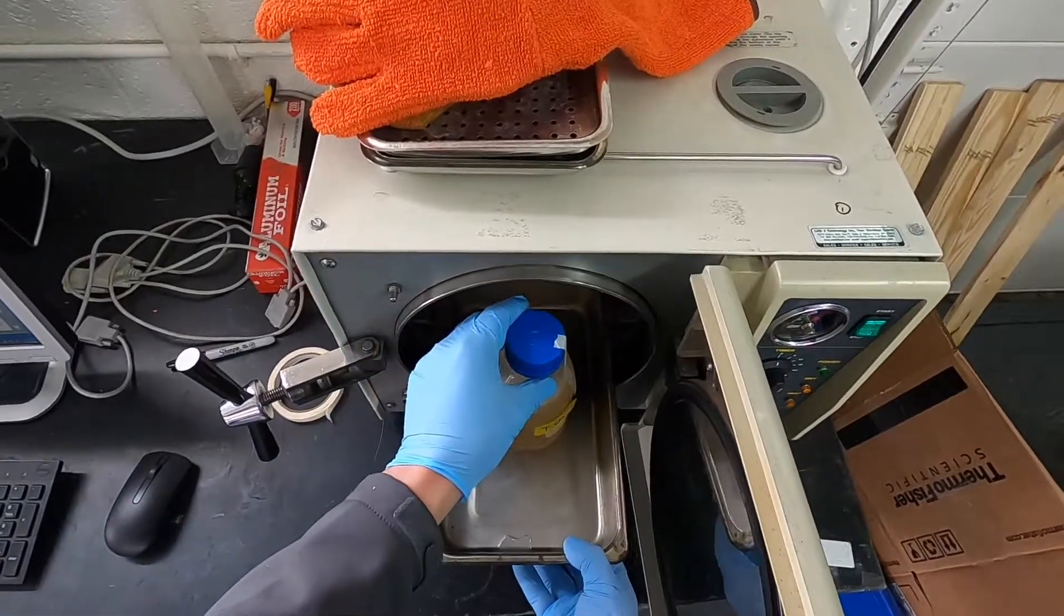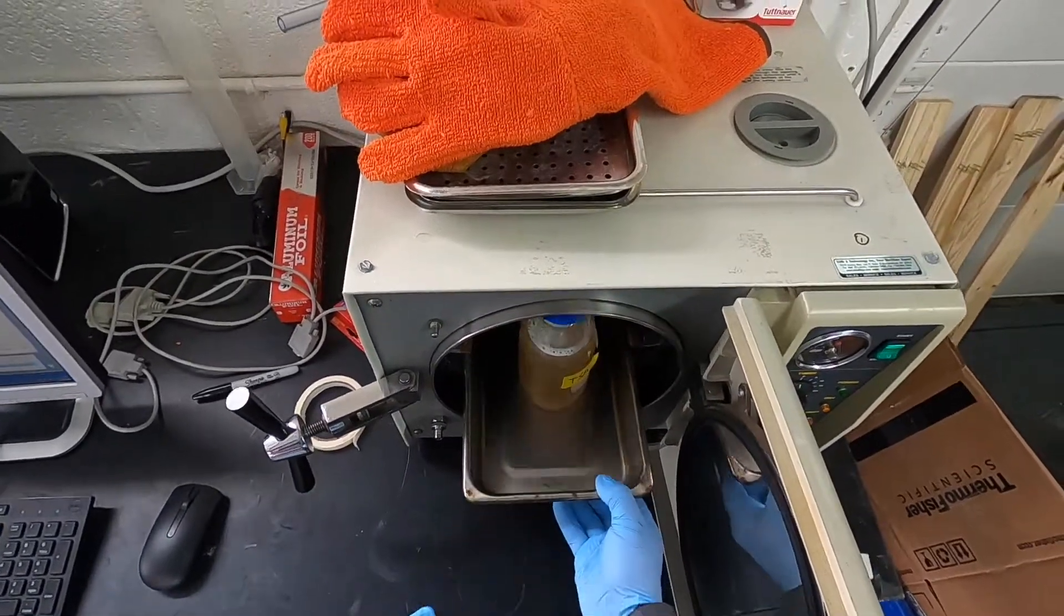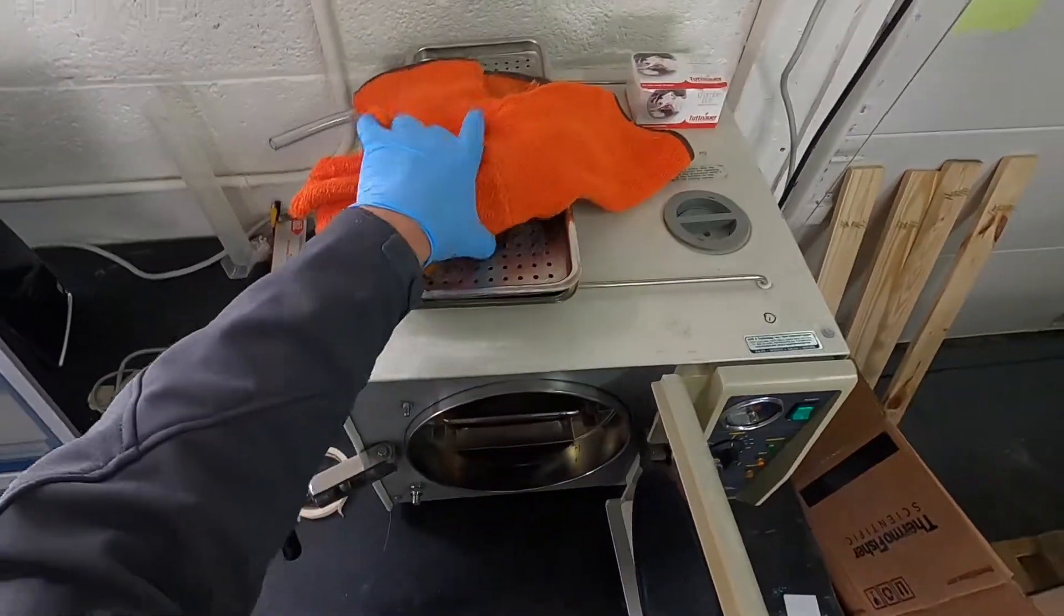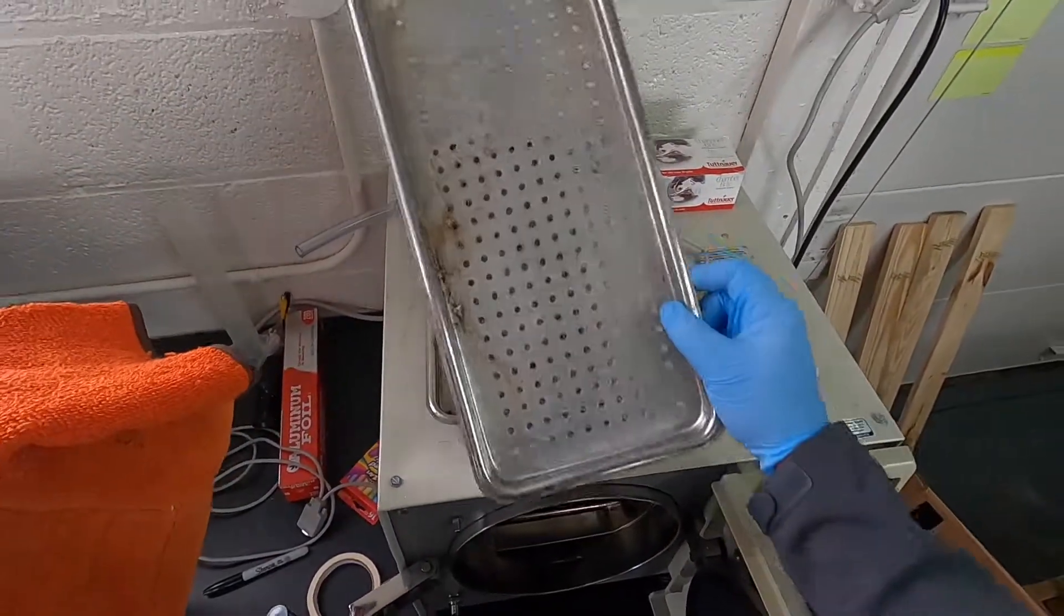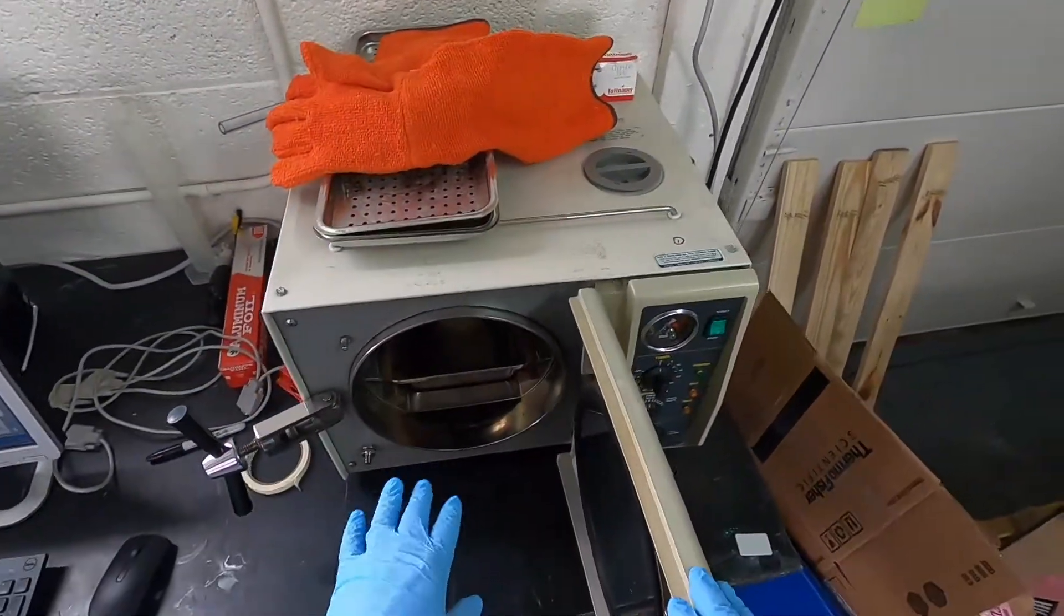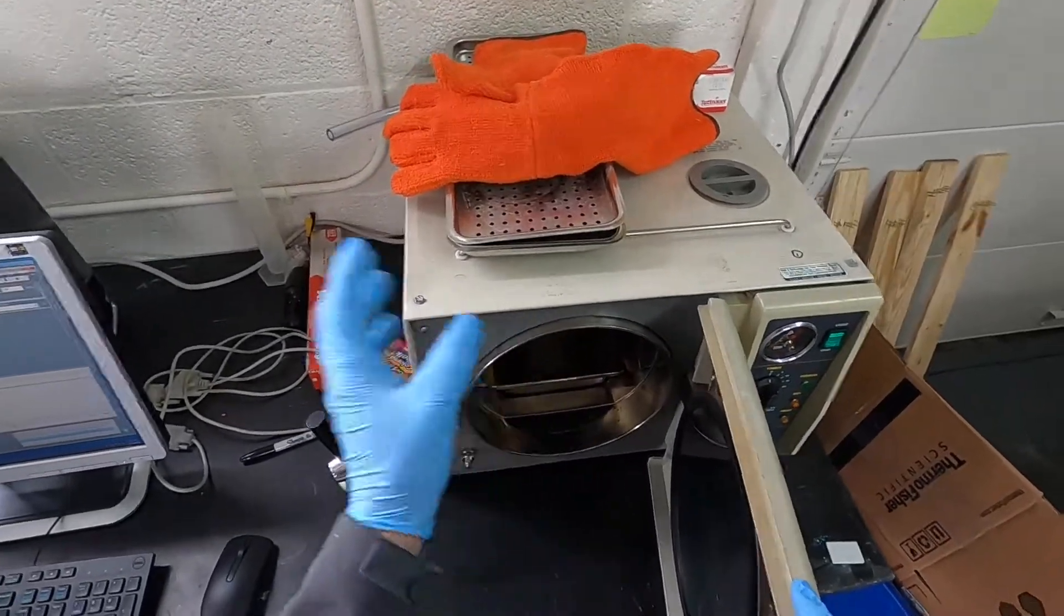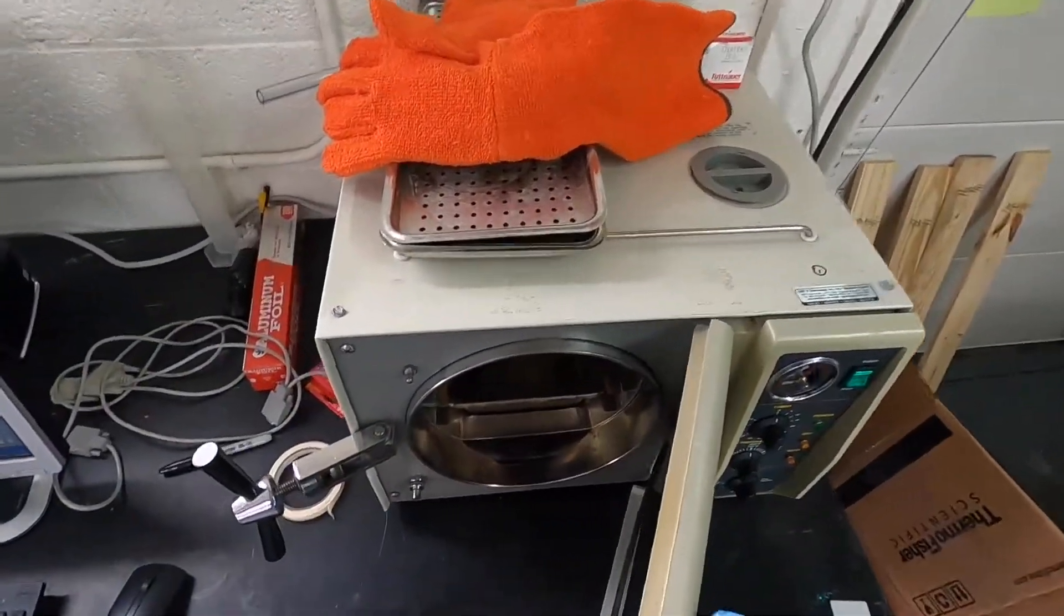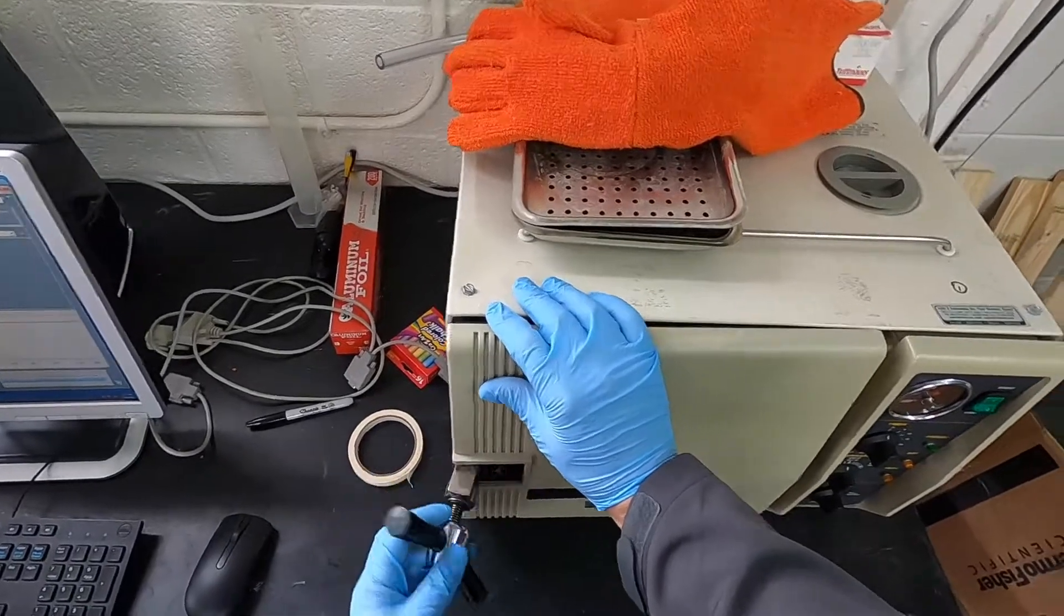Put this in a container that doesn't have holes in it, because whenever you make agar there is boil over. And if you use something with holes, then you get molten agar inside your system, it gets in the tubing, it can plug it up, it can just really gum up and mess up an autoclave.